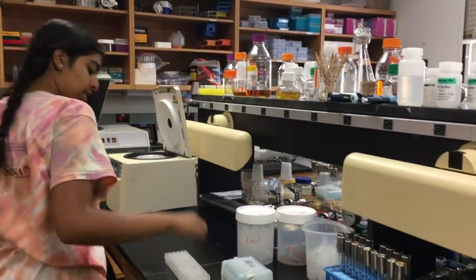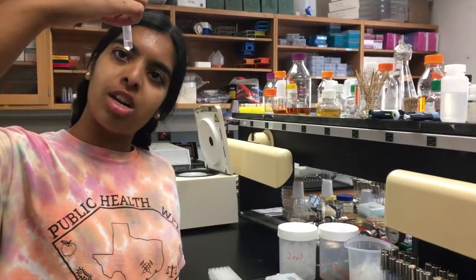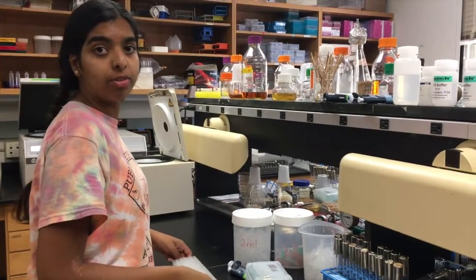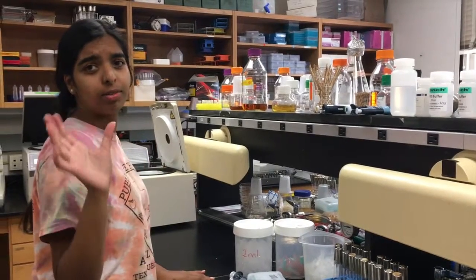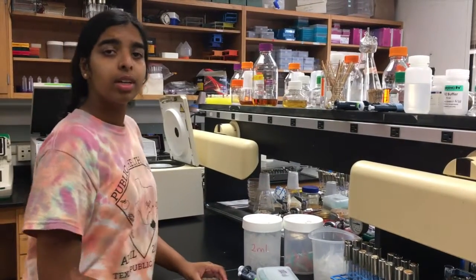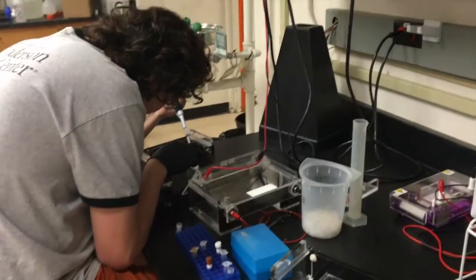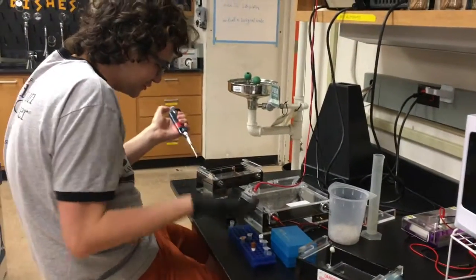Now I don't know exactly what I'm supposed to do next — we'll wait for Yellman because I've never actually gotten this far. I think I'm supposed to digest some yeast cell walls, because fungi have cell walls, and I'm going to make it into a spheroplast to see if we can inject this DNA in. That's basically the run-through of what I'll be doing next week. Christian's running another gel — again. That's all I do in this lab: run gels, do PCRs.